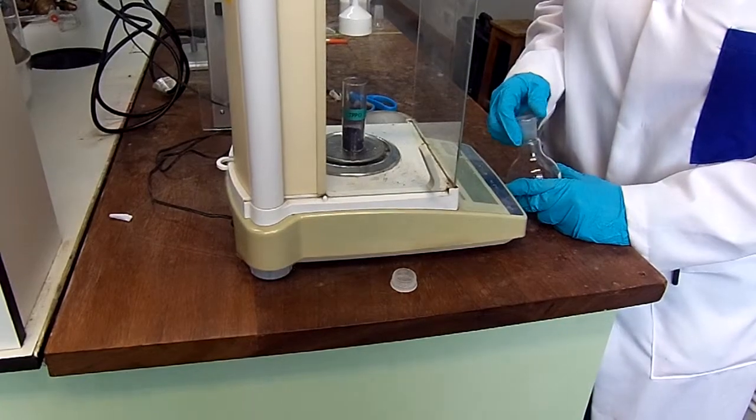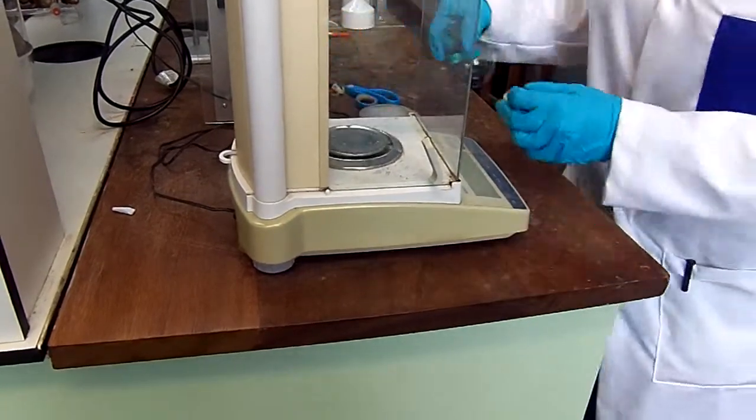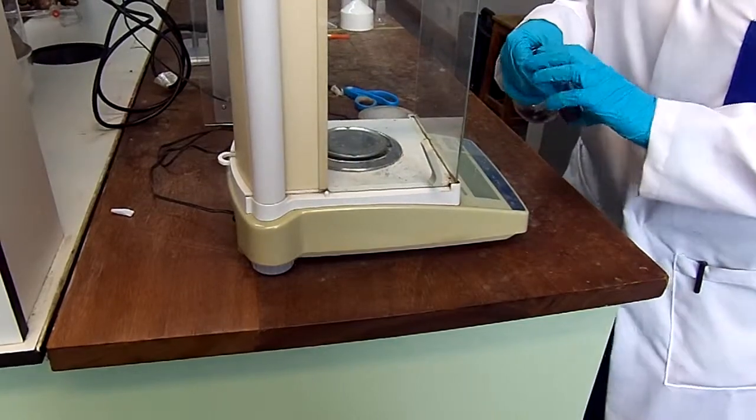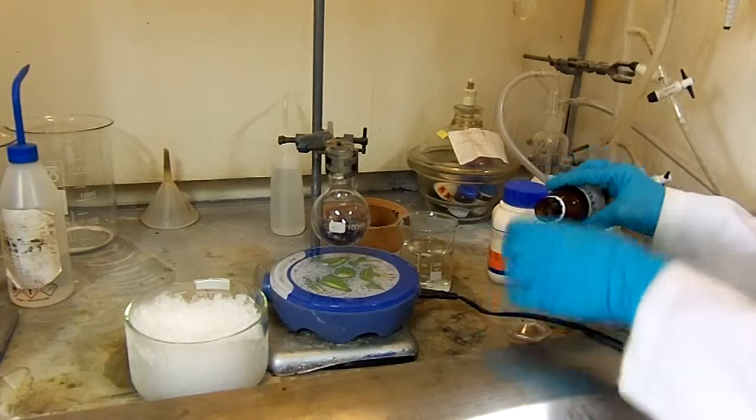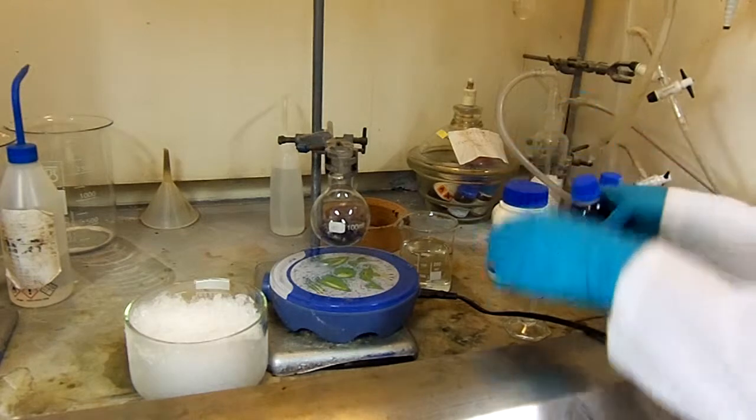Weigh out your TPP. In this reaction it's particularly important that all reagents are weighed out accurately. Dissolve your porphyrin in approximately 10ml of trifluoroacetic acid.